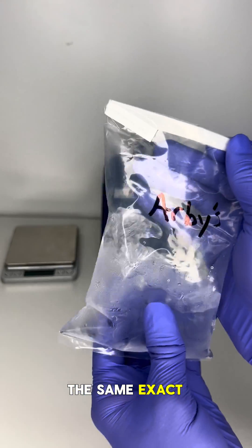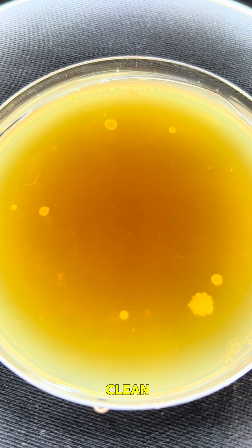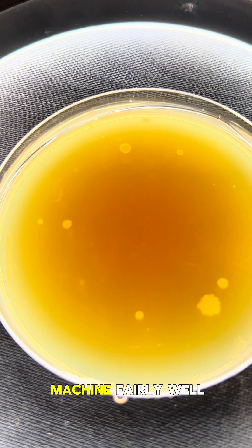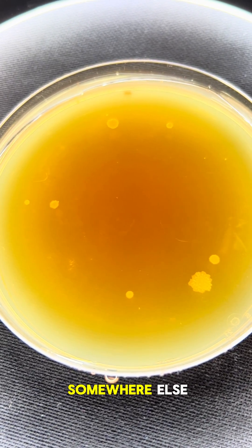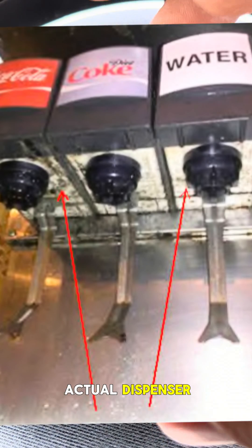When I performed the same exact test on the ice from this franchise, the ice actually came out fairly clean, and from that I can only conclude that they're cleaning their ice machine fairly well. But what they don't know is they've got some sort of contamination issue somewhere else — whether it's in the actual tubing or on the nozzle of the actual dispenser.